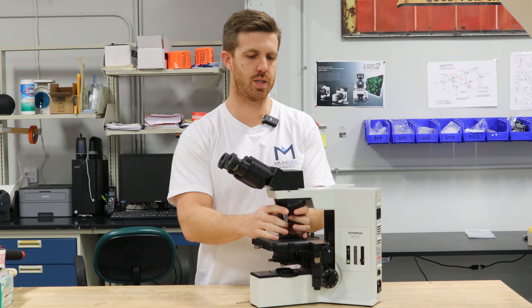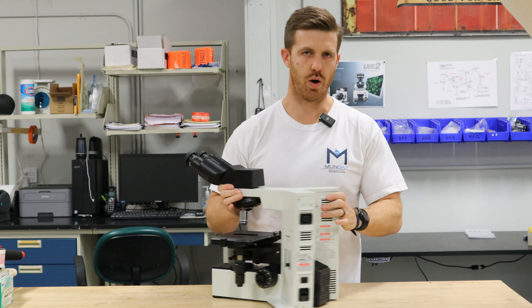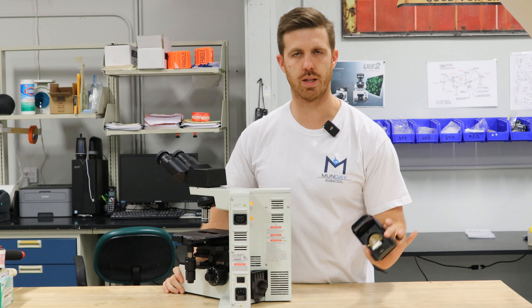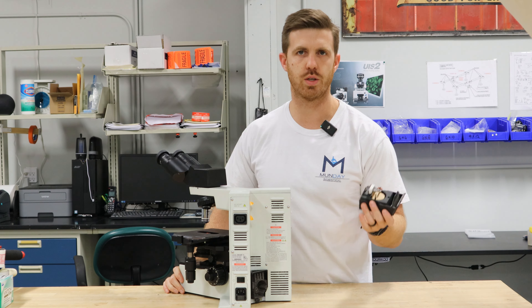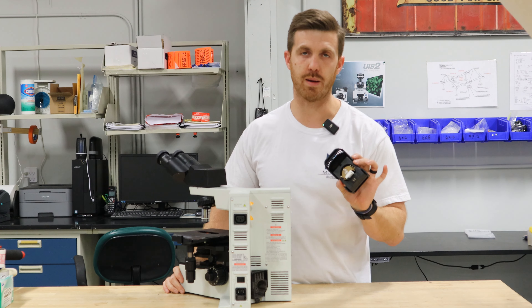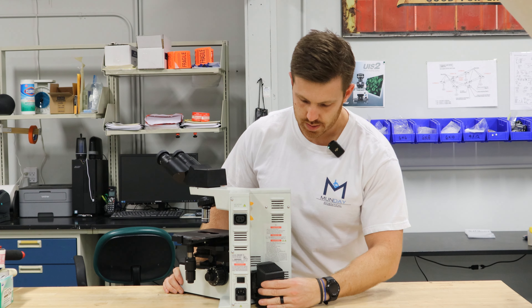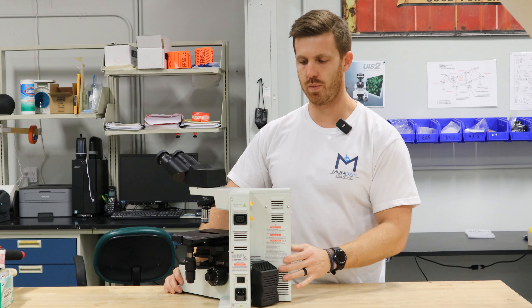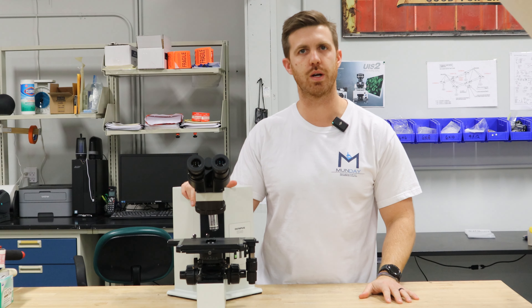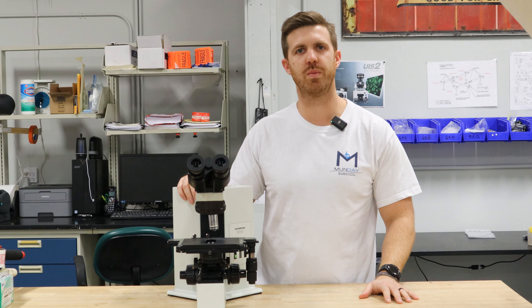Another common thing with these scopes, while we're right here talking about it, are the lamp houses. Sometimes you'll receive these scopes and the lamp house will not be on. It's really easy — you can change the bulb this way. The lamp sockets will go bad sometimes and they'll have to be changed. They slide in with a pin connector. It's really simple to work on these scopes. It's an excellent microscope. And if you have any questions, just drop us a line and we'll be glad to help you.